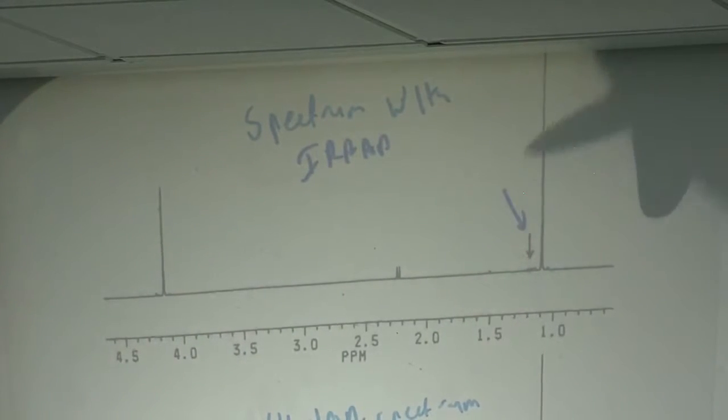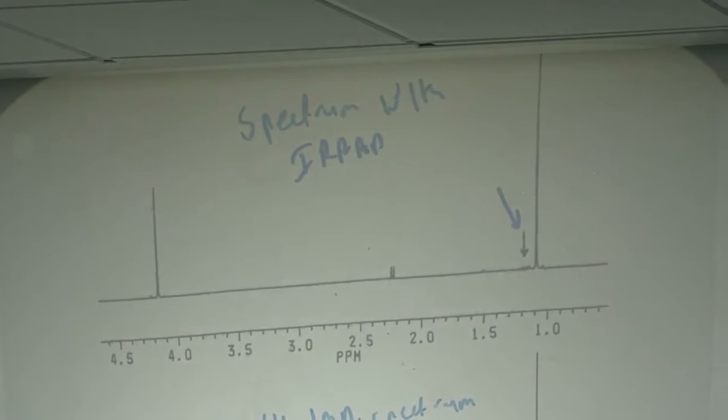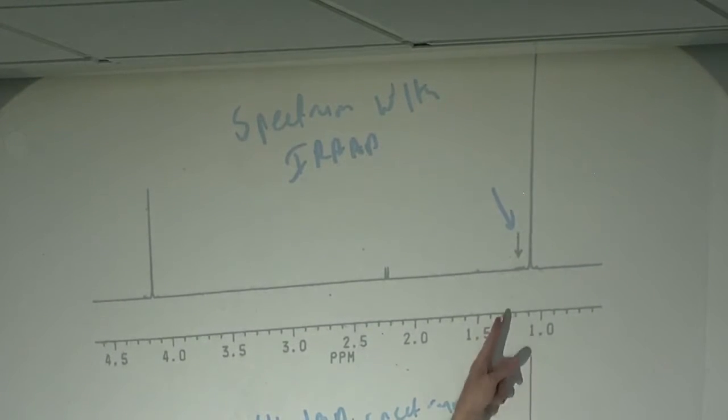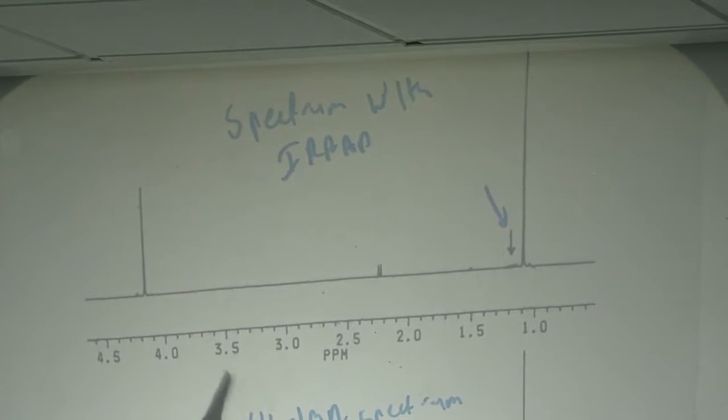And specifically, we've irradiated this proton. And in doing this, the authors didn't quite equalize the population of it. So you still see a little bit of the peak. The peak has gone from this over to the smaller version. And it's hard to tell whether anything's gotten bigger. It looks like that one has gotten bigger.